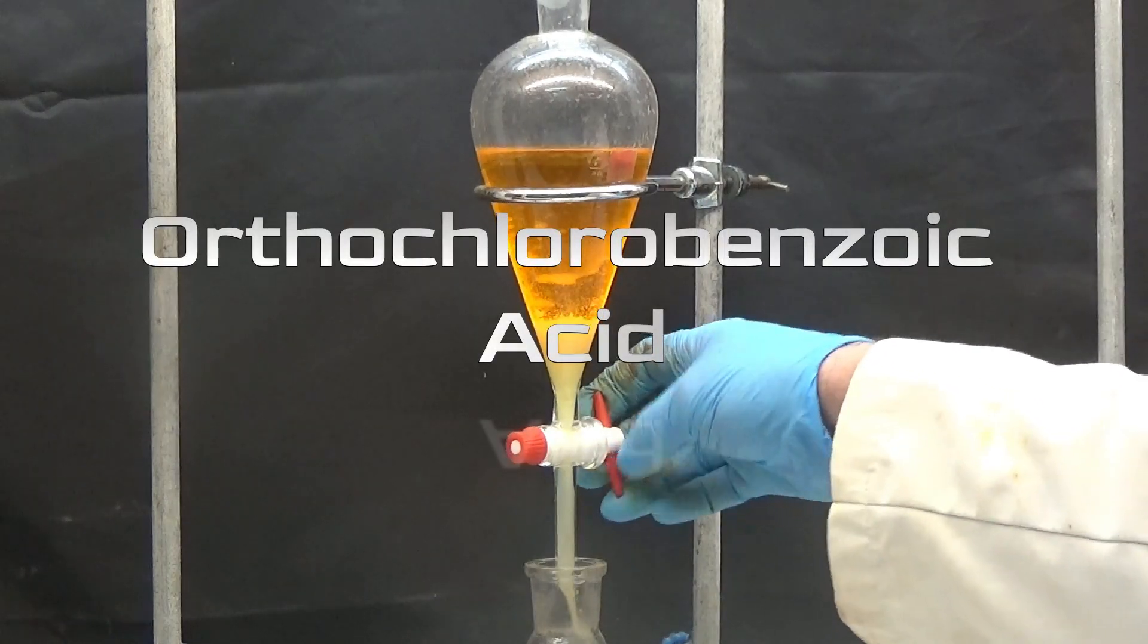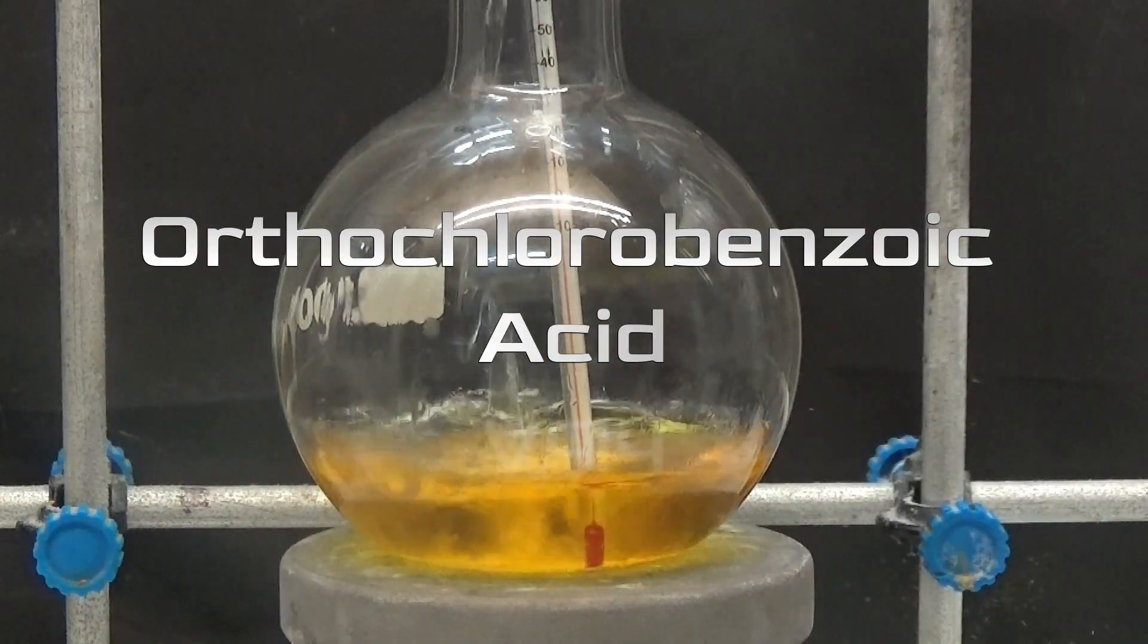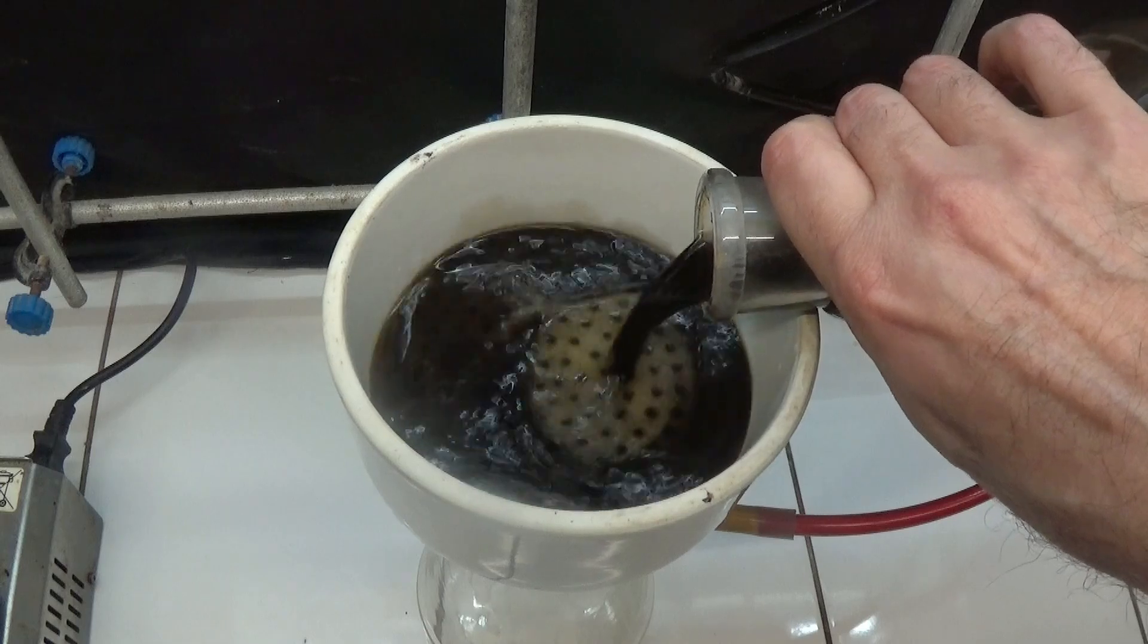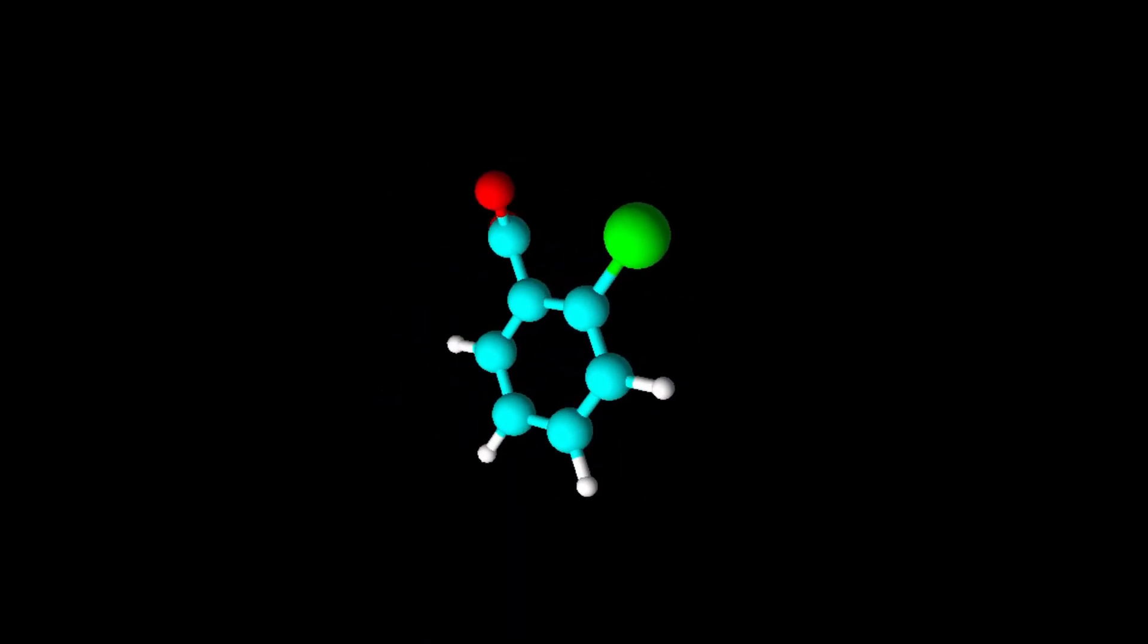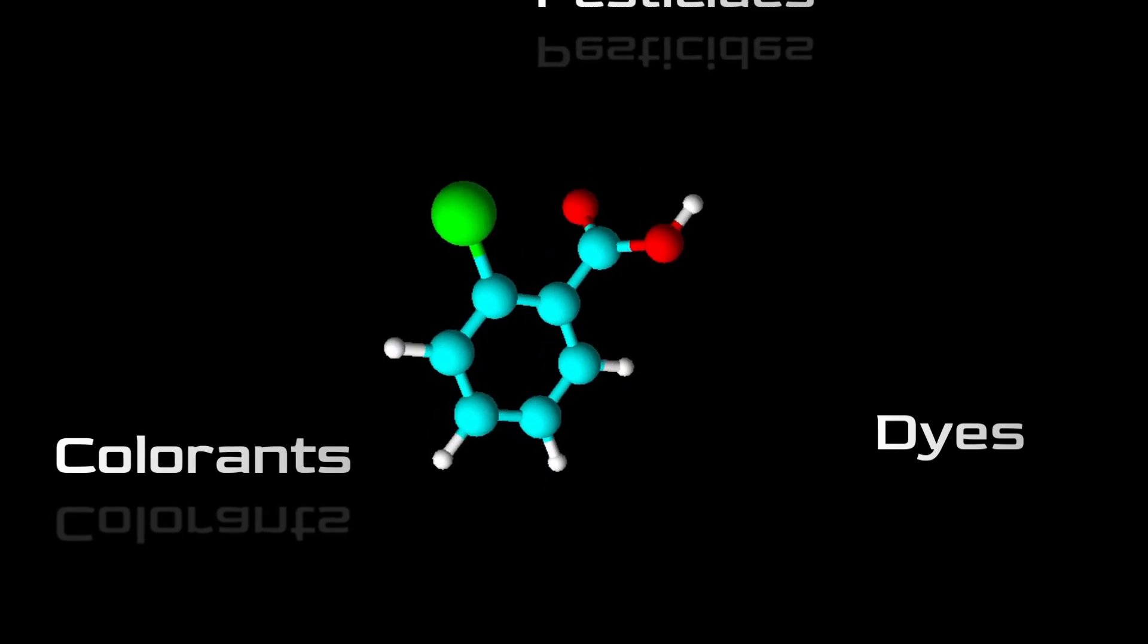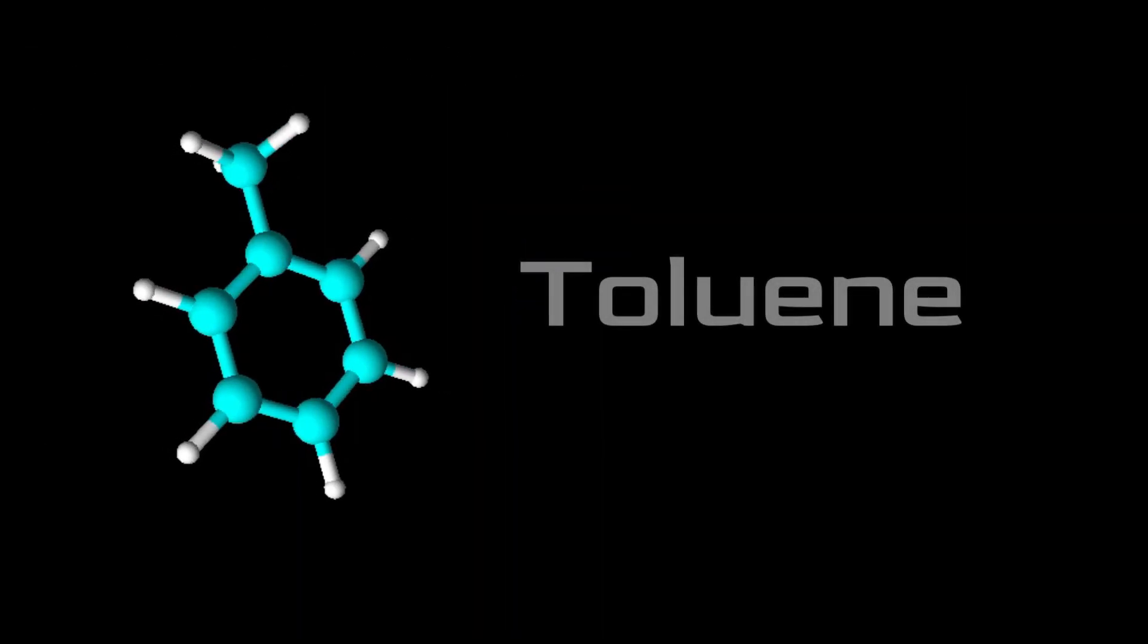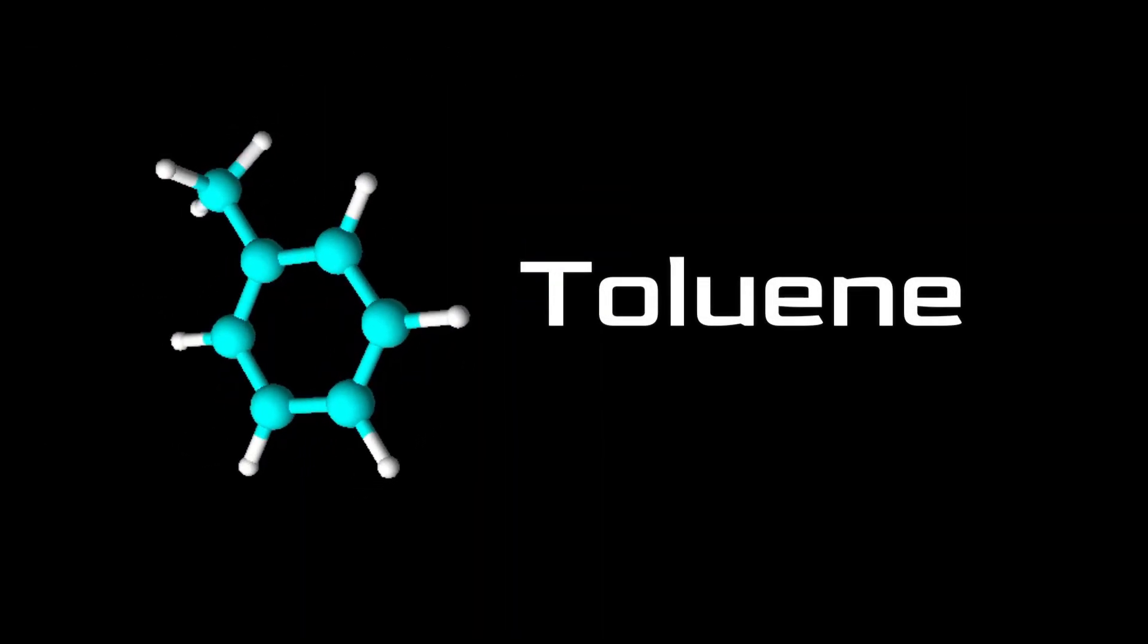In this video we are going to see how to synthesize orthochlorobenzoic acid from toluene as a raw material. Orthochlorobenzoic acid is used in the manufacture of dyes, colorants, pesticides and pharmaceuticals. In this synthesis we are going to use toluene as starting material.